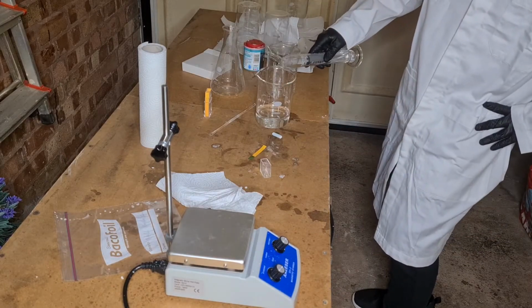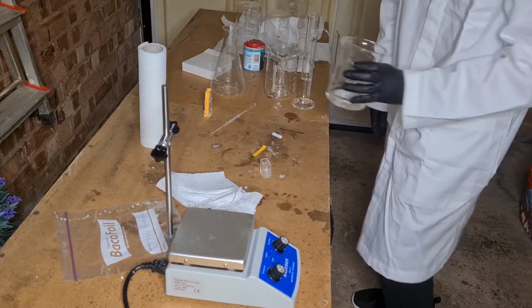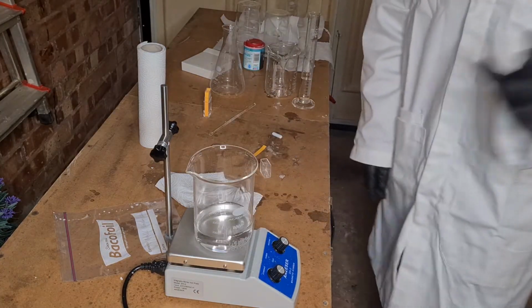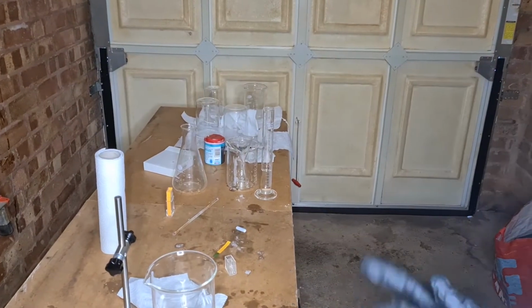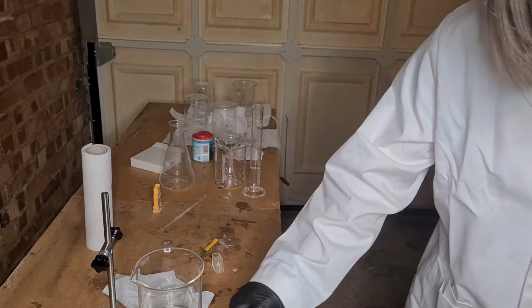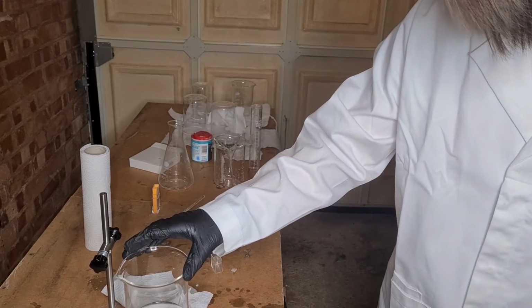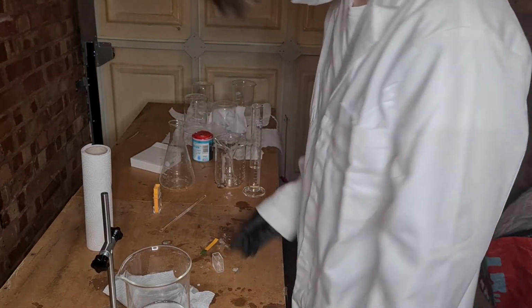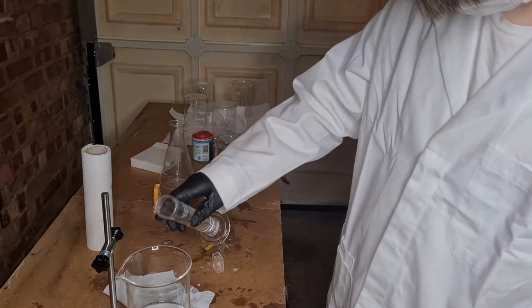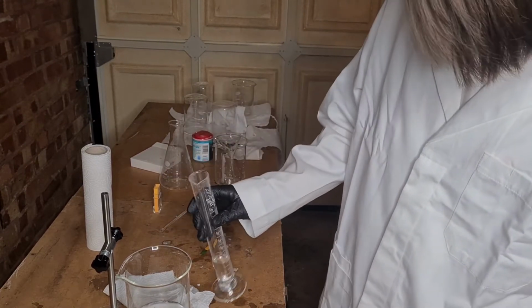So we pour a tiny bit in at a time, and you get a nice bit of fizzing. That's the reaction that releases carbon dioxide gas. We're actually going to put it on the magnetic stirrer and hot plate. Drop the stir bar in. Yep, and that should react everything a bit quicker. So we add a bit more HCl. Get a bit more fizzing.